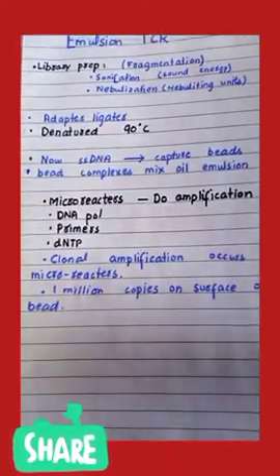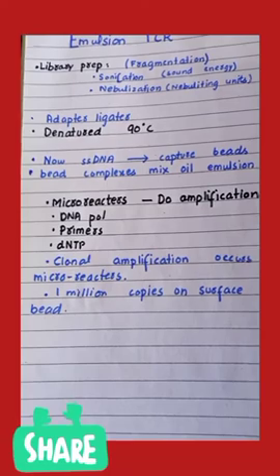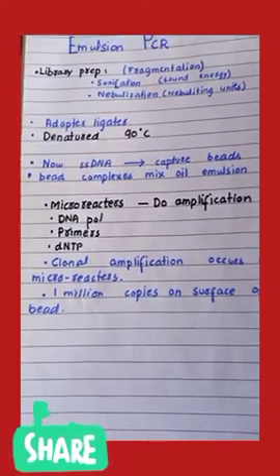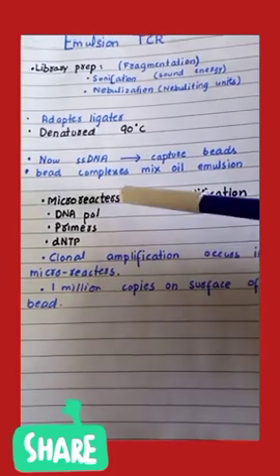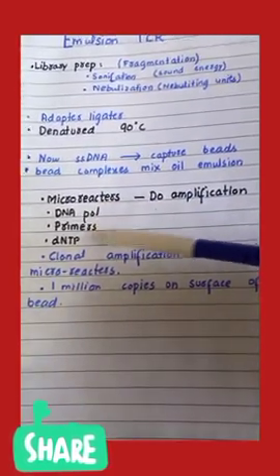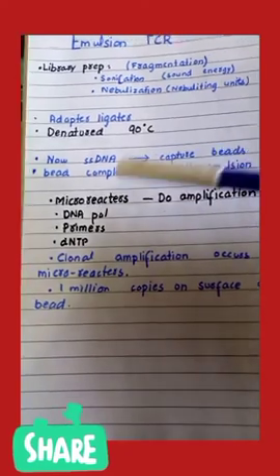This DNA-bead complex is mixed with emulsion oil to form an emulsion complex. This emulsion complex will then be amplified within micro-reactors. Amplification is carried out using DNA polymerase, which identifies the primer — the point where replication starts — and nucleotides are added in a continuous manner.